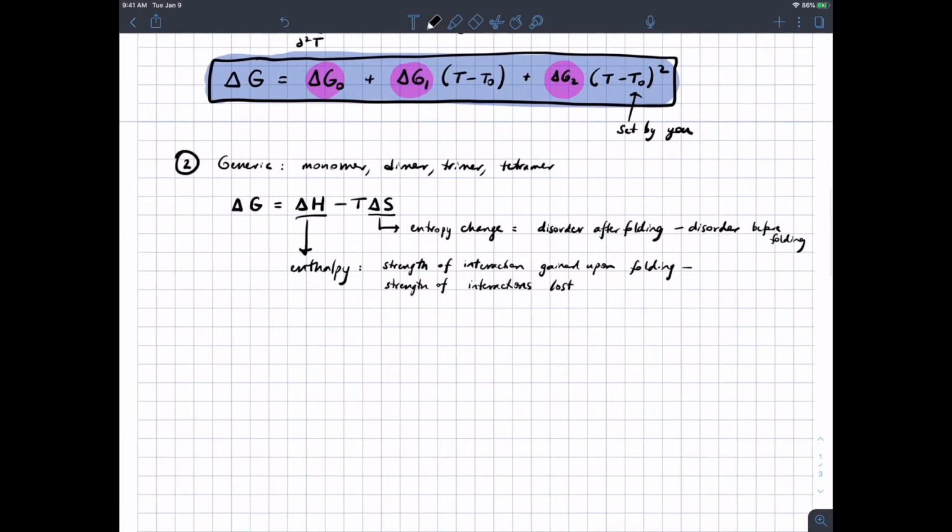However, enthalpy is also temperature dependent. You feel like you're going down a rabbit hole with all of these nested temperature dependent equations. One of the things that you will have learned from PChem, if you've taken it, is that constant pressure heat capacity is equal to the derivative of enthalpy with respect to temperature.